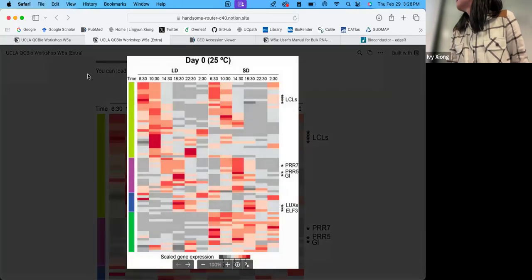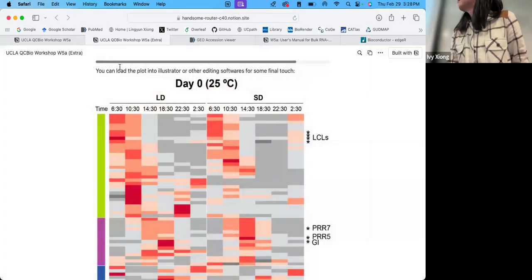So the R script plots the trace command automatically. This is supposed to make this work. It knows where it is. Yeah, so we can open this file and see the two files.